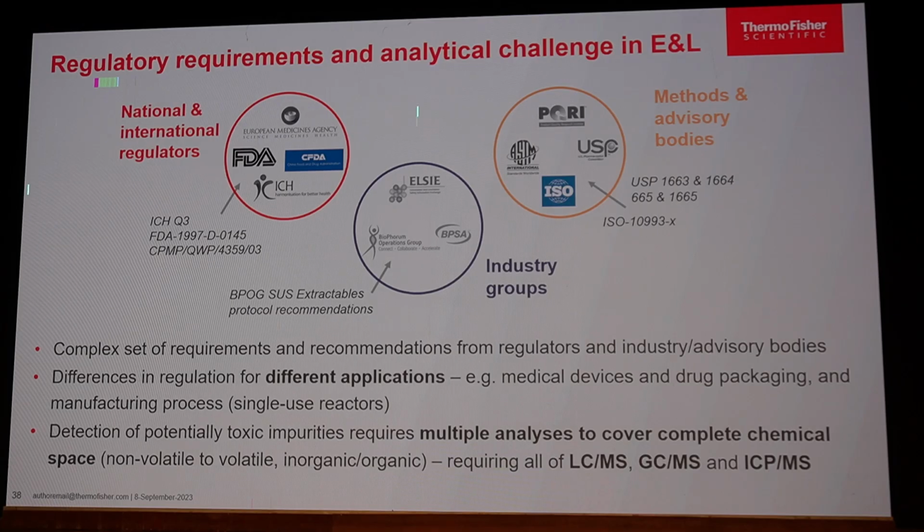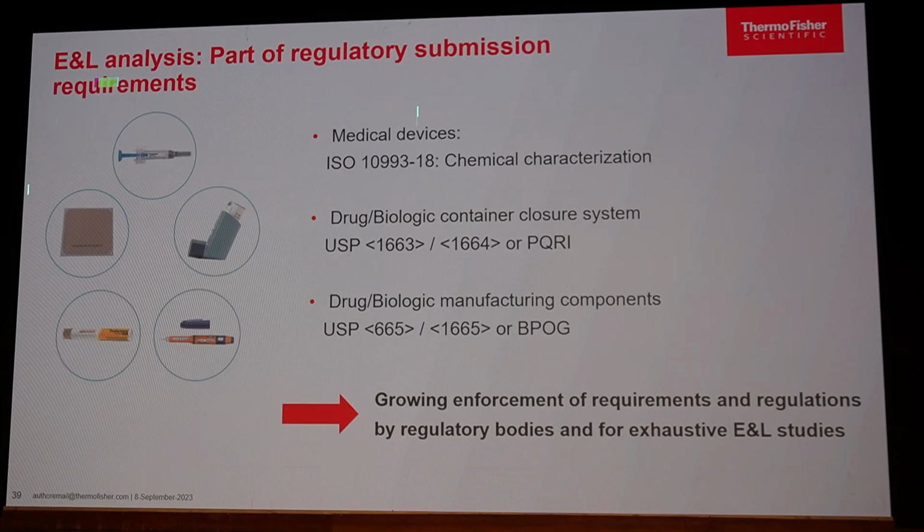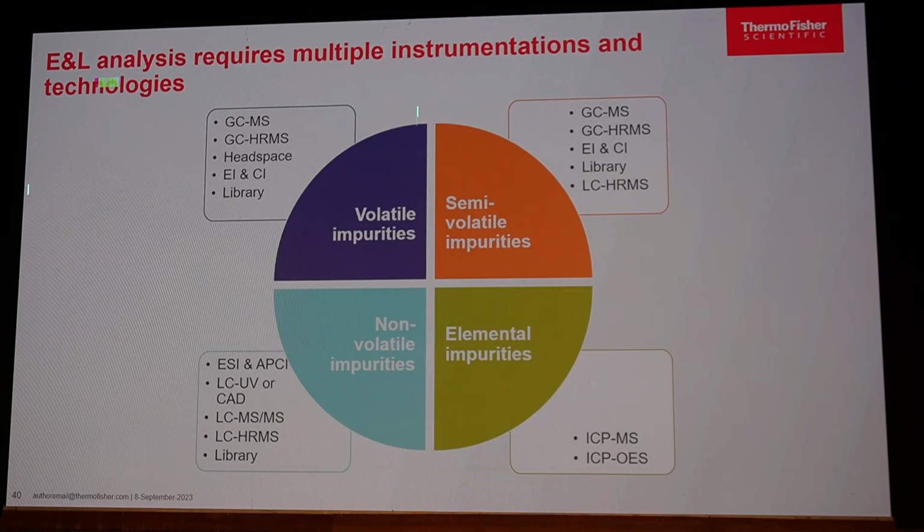And for different extractable studies, you may require multiple analytical techniques. Only GC-HRMS is not suitable, you can have different analytical techniques incorporated to cover all those extractable and leachable materials. There are some medical devices ISO guidelines also available. So day by day, these studies have been implemented or carried out on each and every product in all the pharma industry.